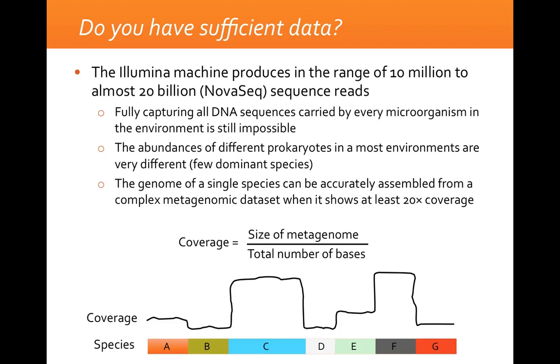But even though this is an enormous number of sequences, it is still far from capturing all the DNA found from every microorganism in a particular environment. And in any kind of environment, the abundances of the different microorganisms will vary a lot. So you will have some species that are present in large amounts and others that are barely visible.